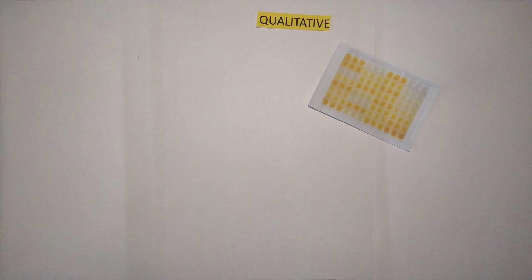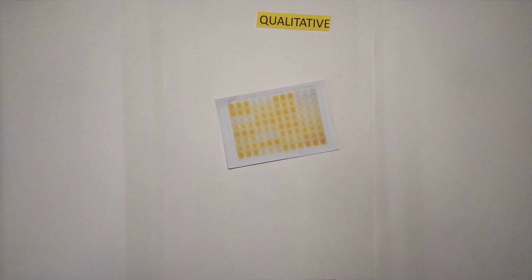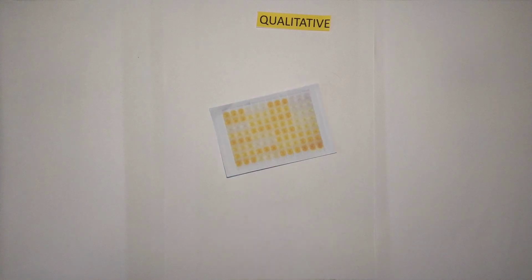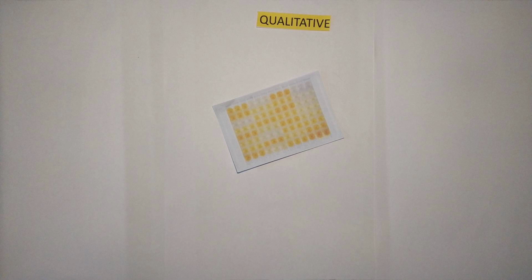Let's check the quantitative and qualitative assessment of sandwich ELISA. If we want to qualitatively assess if antigen is present or not, we can comment by observing the color development. If there is color development, it indicates that the antigen in the study was present in the sample. Whereas, if there is no color development, it means that the antigen in the study was absent in the sample.